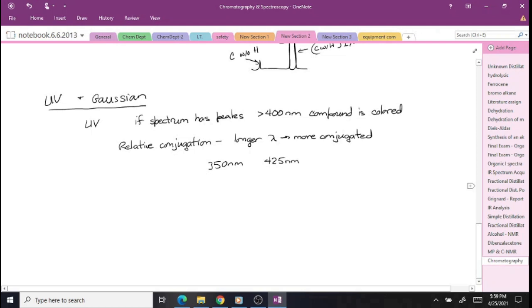That's all we looked for with the UV visible spectrum with respect to lab. We didn't try to look at chromophores and determine, well, we have a peak at, say, 250, which is a chromophore for a particular absorption for aromatic compounds. We're not interested in that. Simply which one is more conjugated. And that is pretty much what we did with the Gaussian as well.